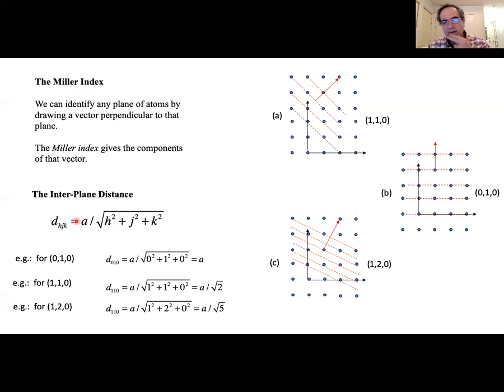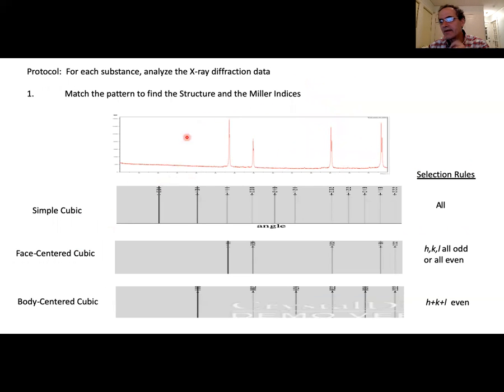So here's how it's going to work. First, we're going to do the X-ray measurement and get our X-ray data. This is what it might look like. This shows peaks at various angles. Oh, one detail. On our machine, when it makes this graph, it's going to show X-ray counts, that's intensity, versus angle. But on the angle axis, it's actually 2 theta, not theta. I don't know why they do this, but it's kind of traditional. So something to be aware of. Anyway, let's leave that aside for a moment. Very good. So we'll get this pattern of lines.